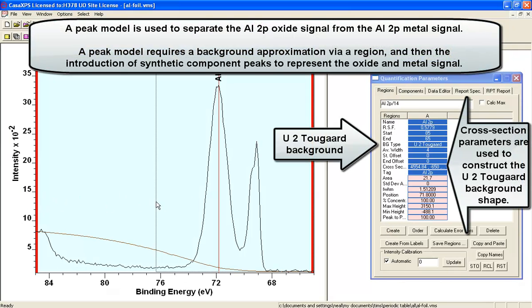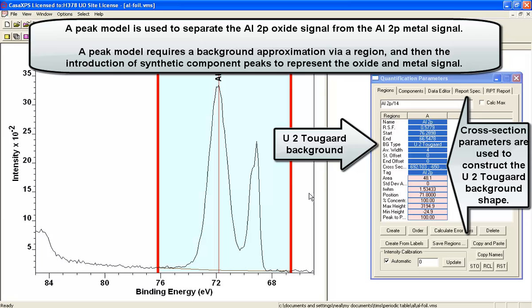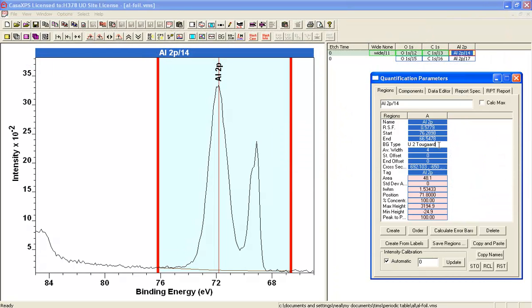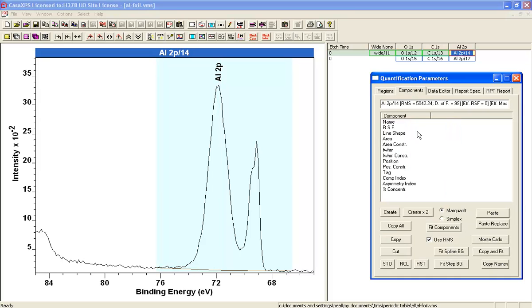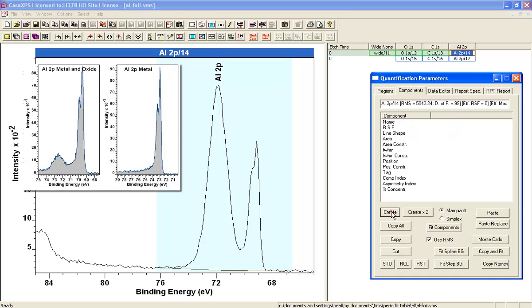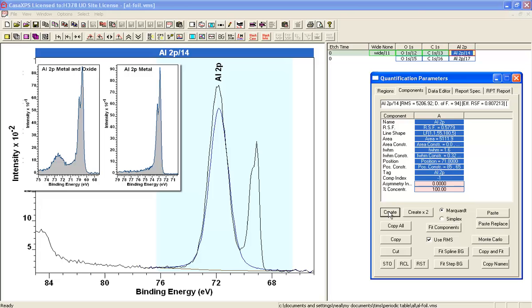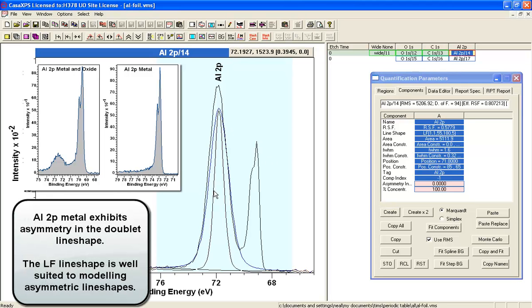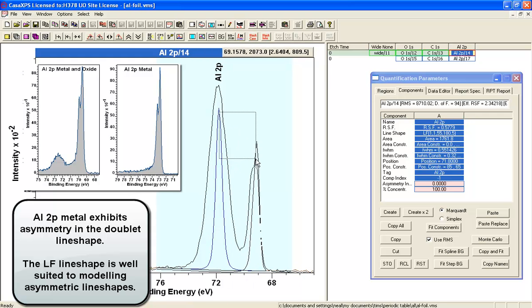So the background is a U2 Tougaard background, and we'll go for the component and introduce some synthetic components. Here we've got one peak here which has come in as an oxide, so I'm going to thin this down and then I'll move this over to the metal.